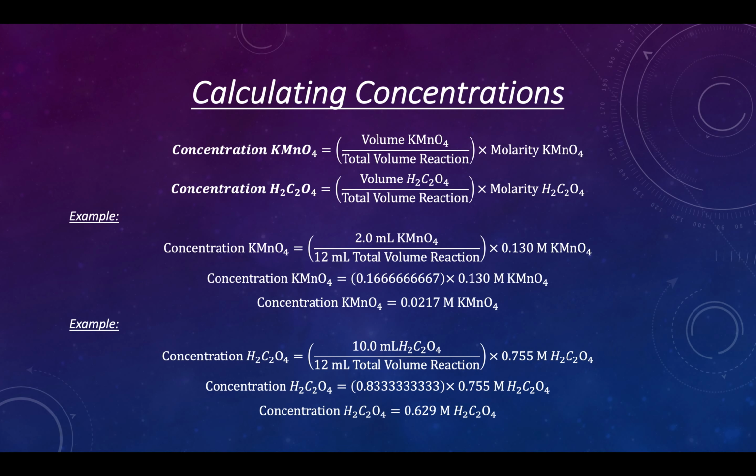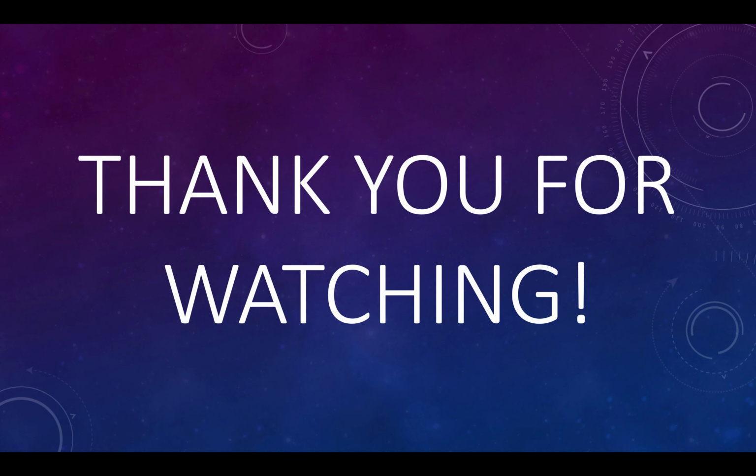and our concentration ended up being 0.629. And thank you so much for watching.